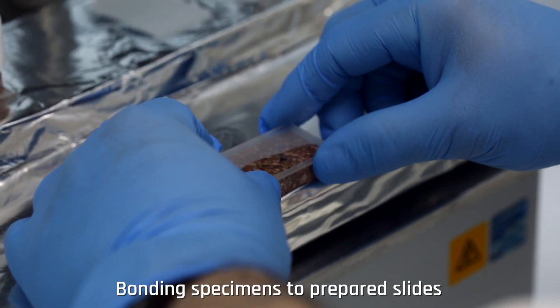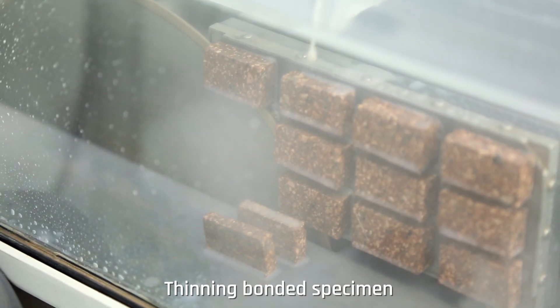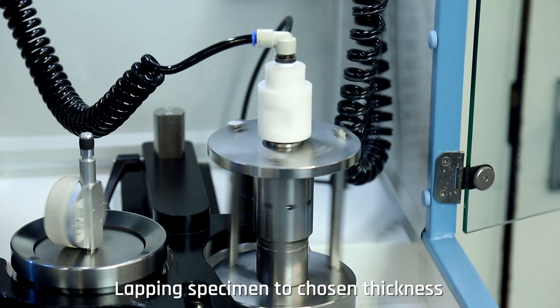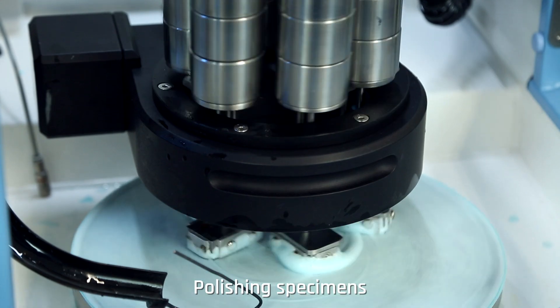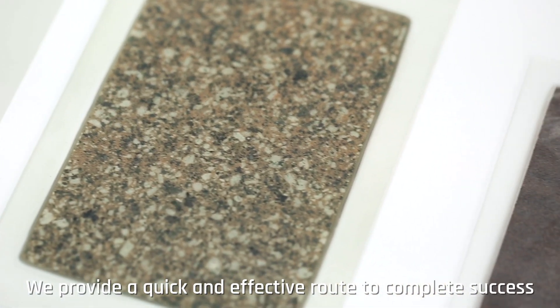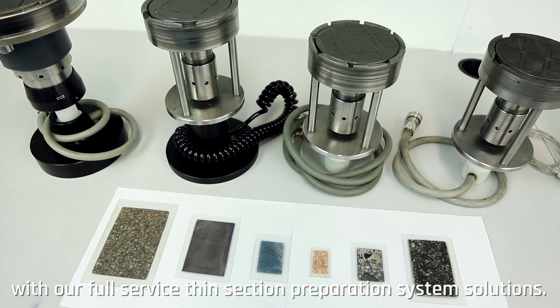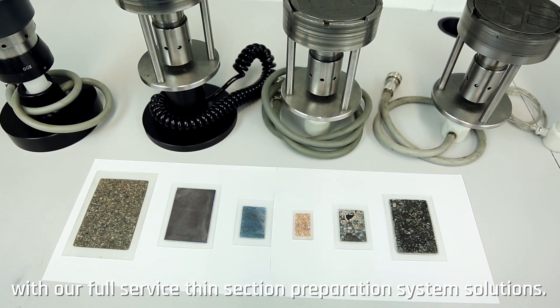Bonding specimens to prepared slides, thinning bonded specimen, lapping specimen to chosen thickness, and polishing specimens. We provide a quick and effective route to complete success with our full-service thin section preparation system solutions.